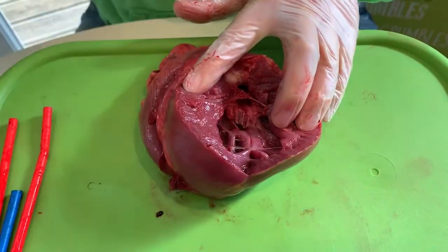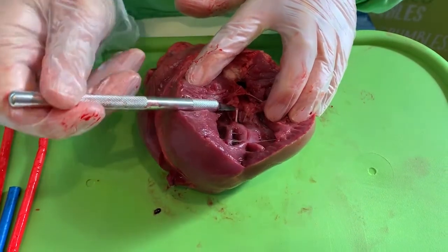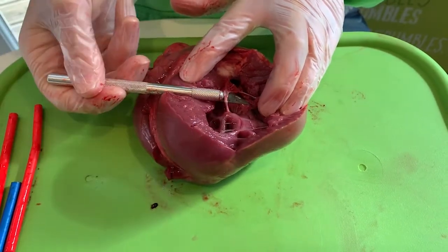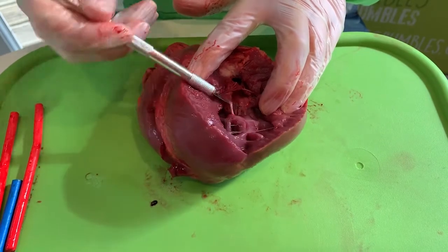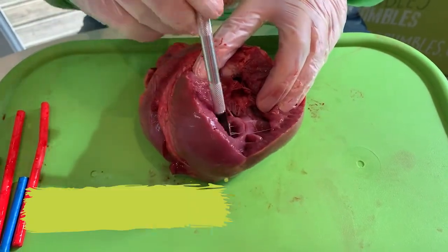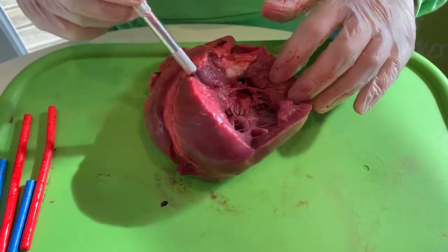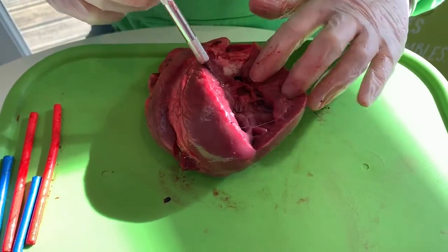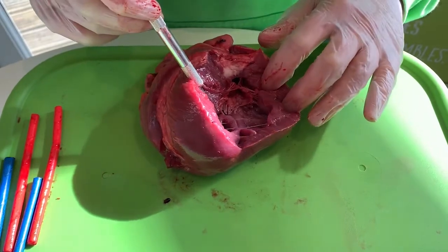Now, you can see the heartstrings in here really, really clearly. And they are really tough. So even though I'm pushing, I'm pulling up there with my scalpel, they are not cutting at all, okay? And then we've got some really big papillary muscles here. The muscles that are mega important for the heart to beat, okay? We've got another valve again up here. And the heartstrings, or the chordae tendineae, are really, really helping with that, okay?